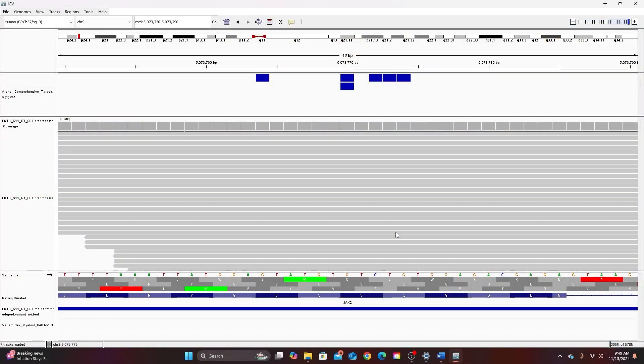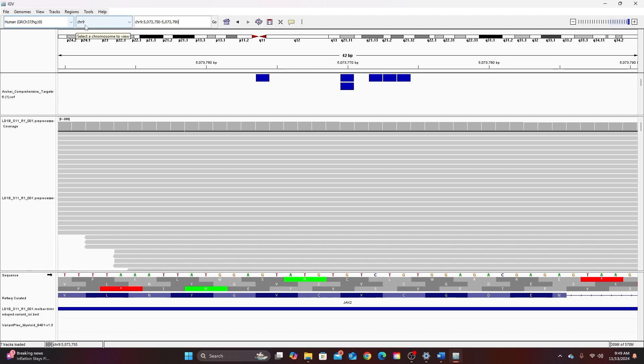Alright, so let's go over the basic layout. I already have some data loaded into IGB. I cover how to load the data in video two. Here is the name of the reference genome I'm using. I cover how to download the reference genome in video one.